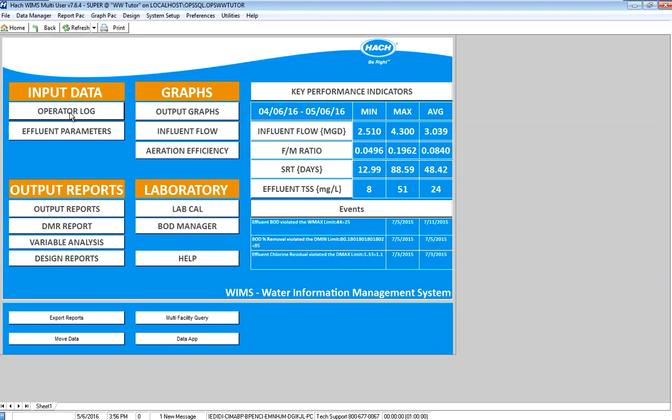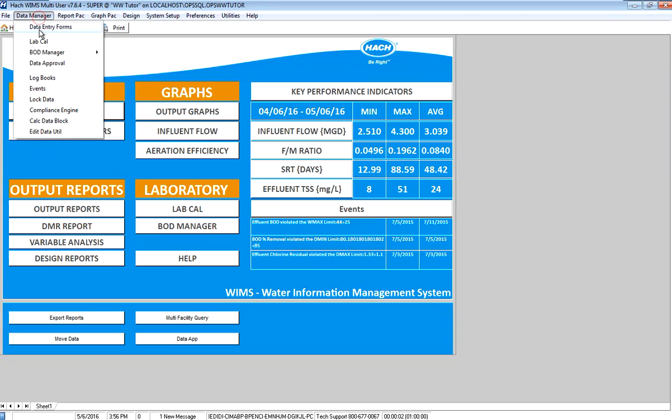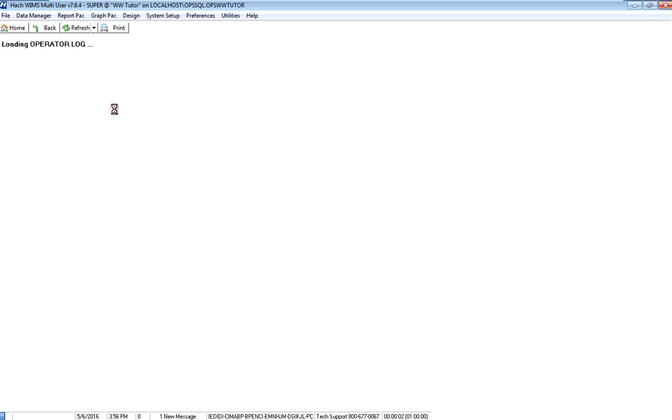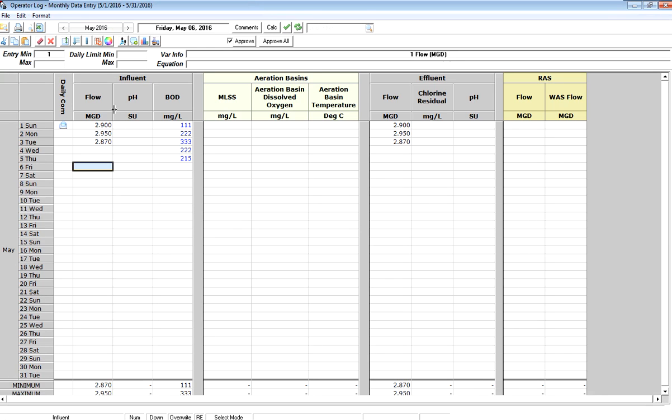I have a shortcut to my operator log monthly data entry form. I can also get to that form through the menu. In this case, I'll just use my shortcut on my dashboard and it's going to load up this form for the current month, which is May 2016.